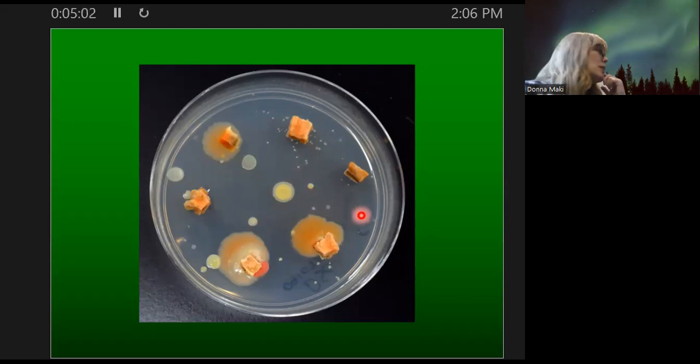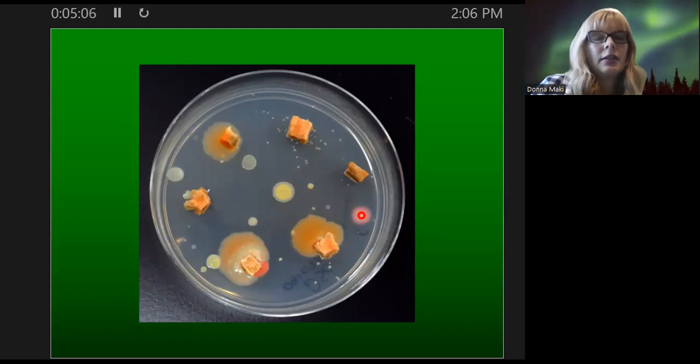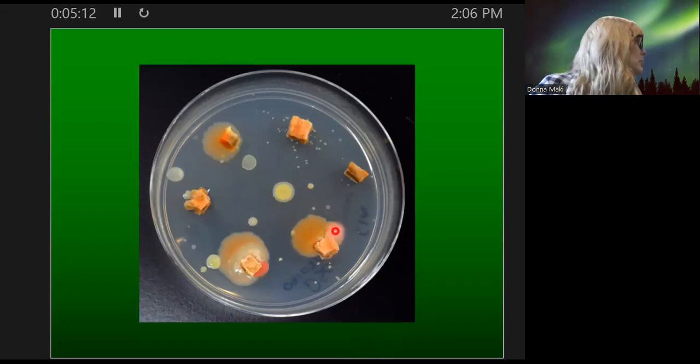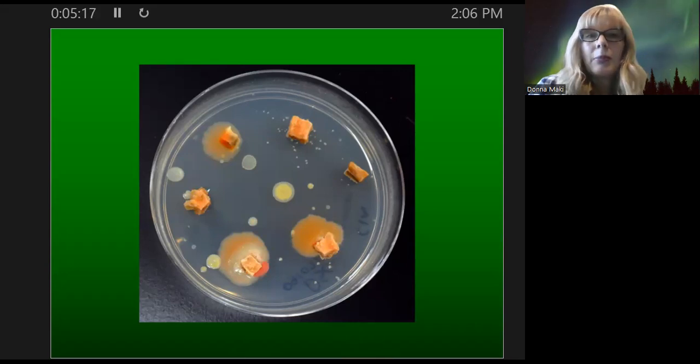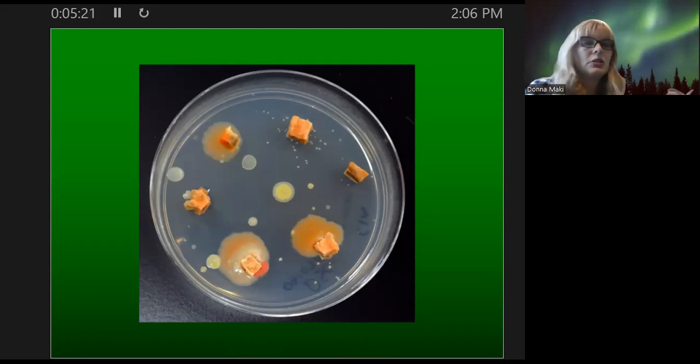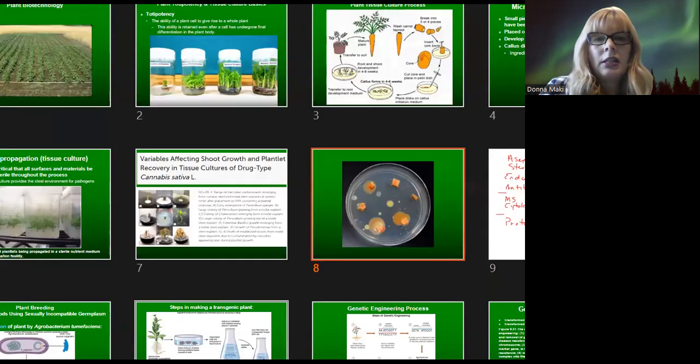That's something you should always key in on, because it makes a difference in answering: is my technique good or not? There's not a whole lot you can do about the endophyte issue, though, unless you hit upon a good antibiotic mixture. So I wanted to include those. I'll update the slide set to include these, so you'll have these images as well.